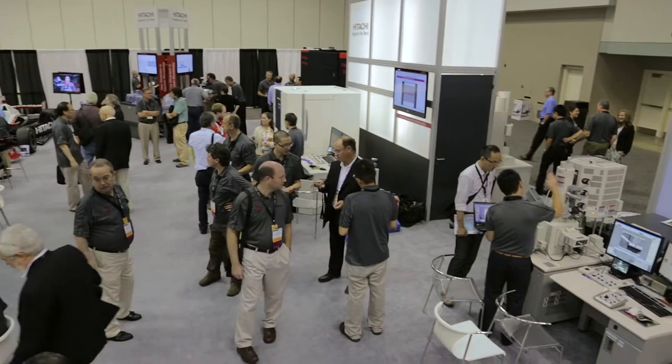The booth was the hit of the show, with participants getting a sneak peek of the newest technology from Hitachi, including a brand new electron microscope slated for a late 2013 release.